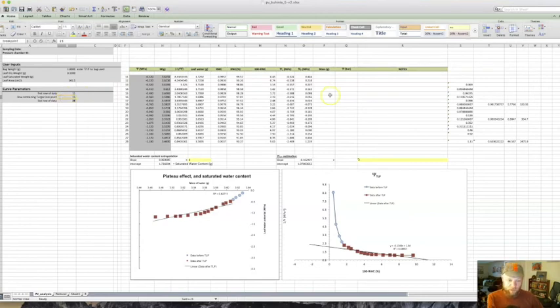And then this row is going to be the row containing the turgor loss point. So the point right before the linear portion of the line starts. And so really there's a couple things you have to look for. First, you want to change this middle point until the R squared over here gets as high as possible. So that R squared is just telling you how well that linear line fits the data. And for us, the closer it gets to 1, the better it's fitting the data. With the caveat, if you get down to 2 points, it's going to be 1.